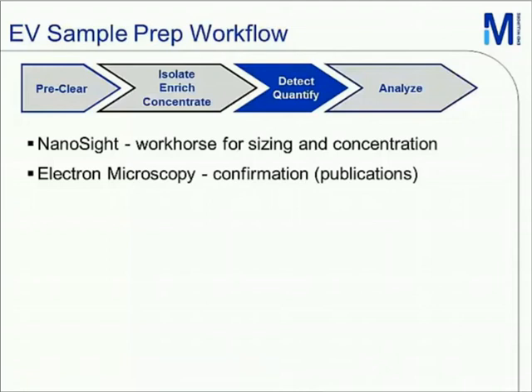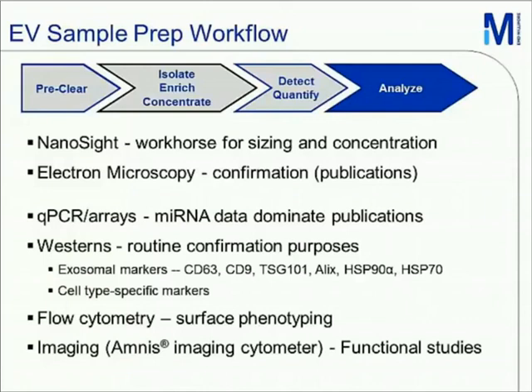Similar to cell analysis, there is interest in knowing what's inside the EV as well as what's on its surface. Of particular interest recently is miRNA content, given the relationship between the presence of particular miRNAs and certain diseases. Lastly, purified EV preps are now being labeled and used to study mechanisms of uptake, with the potential goal of EVs being used as therapeutic vehicles.